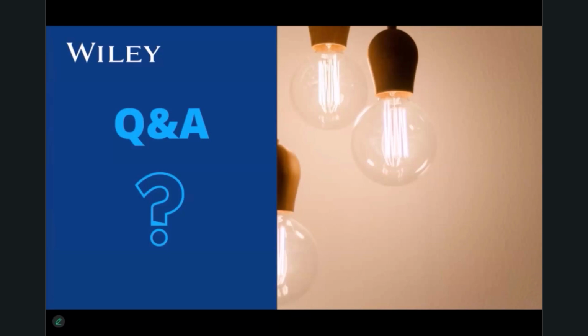Thank you, Michelle. I think we have some time for maybe one or two more. How about this one? If I perform a batch classification on all the spectra in a database that I built, can I then save my classifications in that database? I'll take this one. Yeah, so once you perform a batch classification, a field will be added and the classifications will be output to it. Then you can save the database with the classifications included if you wish. It's pretty versatile that way. Great, thank you, Calvin.